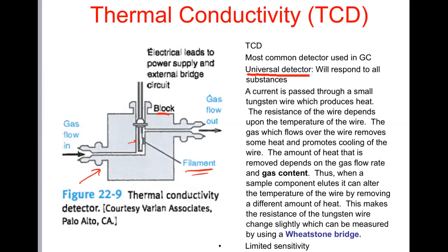Now, think for a second about what the factors responsible for that temperature are. Well, one would be the current, right? More current, more heat generation. But let's just say I keep the current constant. What other factors might affect the final temperature of that tungsten filament? Well, one thing that comes to mind is the rate of loss of heat energy from the filament.